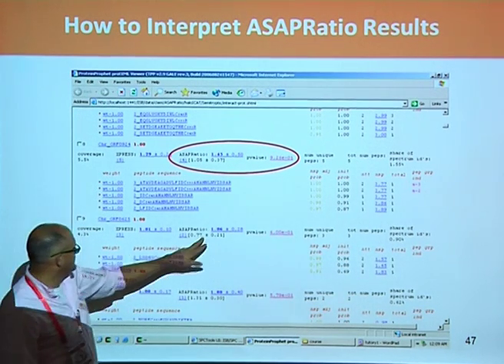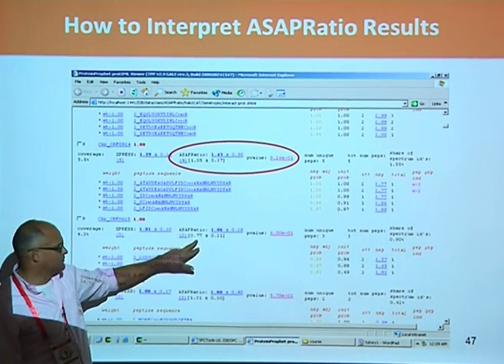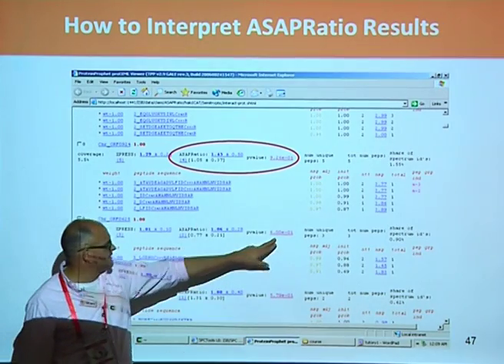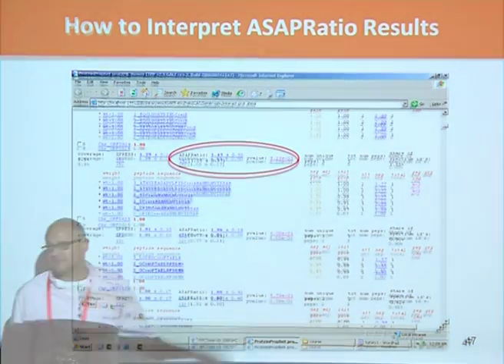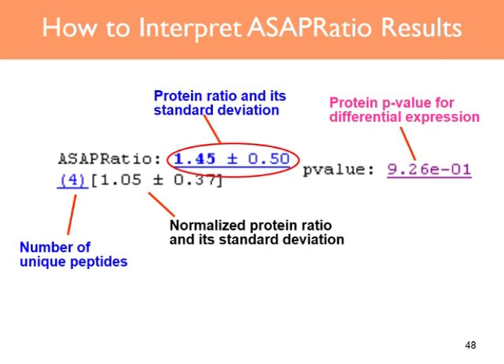This one down here maybe is a little more interesting because it was 1.06, but after you normalize only 0.77, and based on the profiling, the p-value is 0.6. Well, still not great, but still more interesting than the other one. Oh, and so that's the blow up of... I always forget that one comes right after that one. So now you can actually read it.